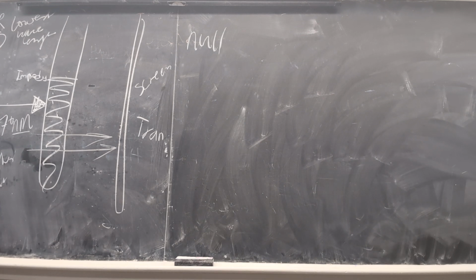Okay, so now use the pipettes. The 4 of them are gonna have the same thing, except one thing that's different: pH. So begin with labeling. Actually, label all of them. The one that has pH 7, the one that has pH 3, pH 9, but everything else is gonna be the same. Everything is the same for the 3 except the pH.